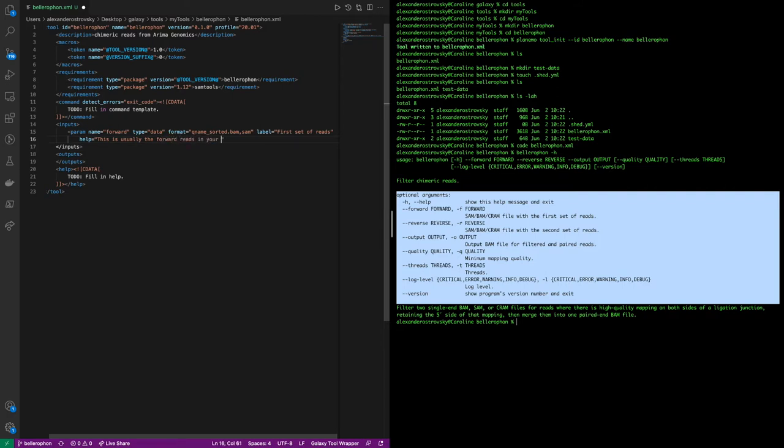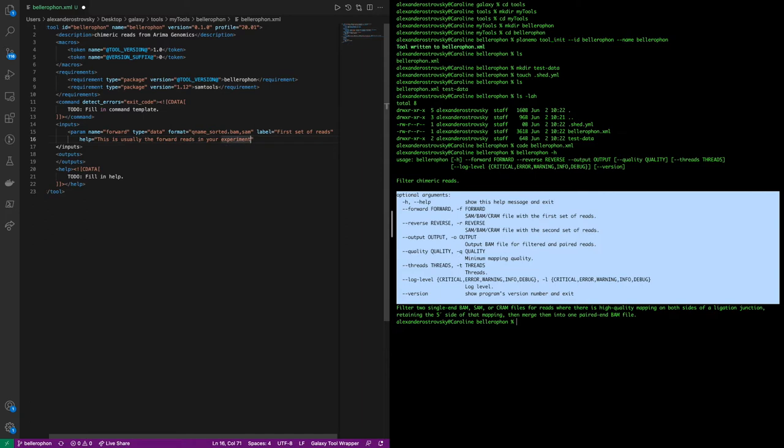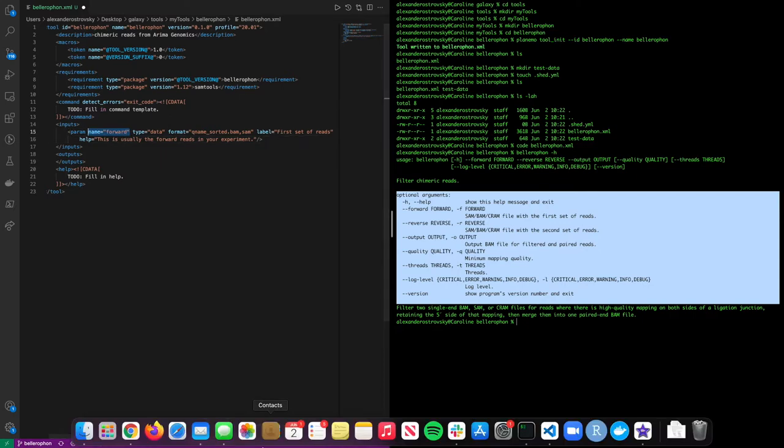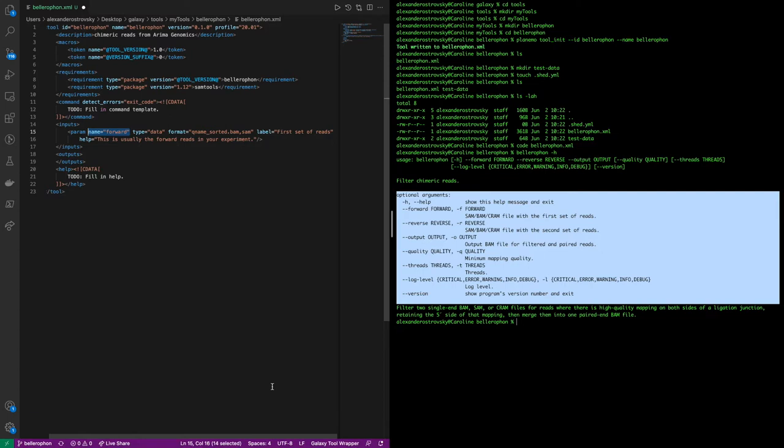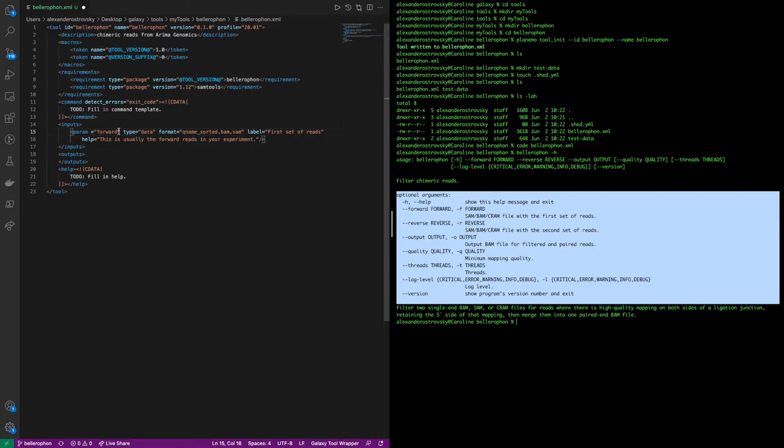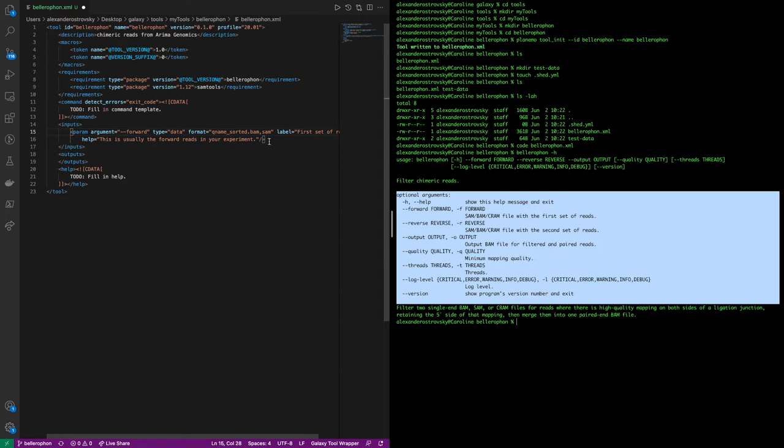Now, normally, we could also set an attribute called argument here. Argument simply shows to the user what the actual flag that would refer to this variable would be in this case. However, since the name of the variable is the same as the long flag for the variable, we can simply change the name attribute to argument, as well as adding the flag's dashes. We will then repeat this, in this case I'm simply copying and changing out text for reverse.